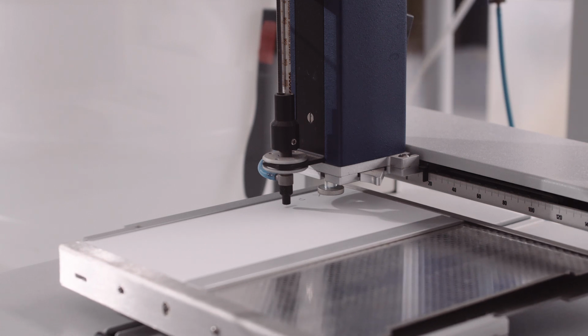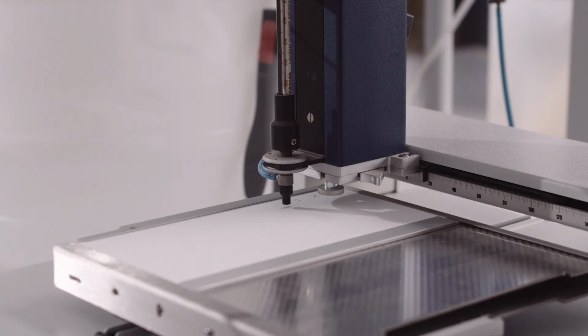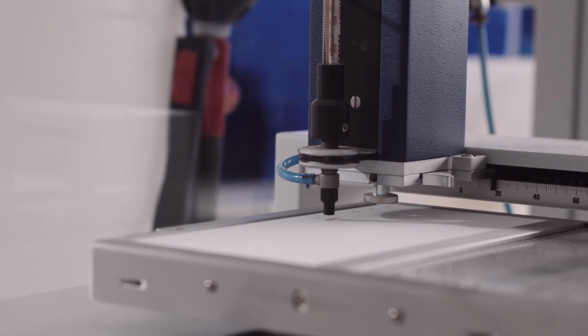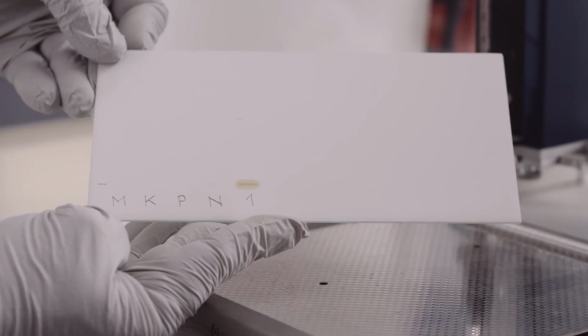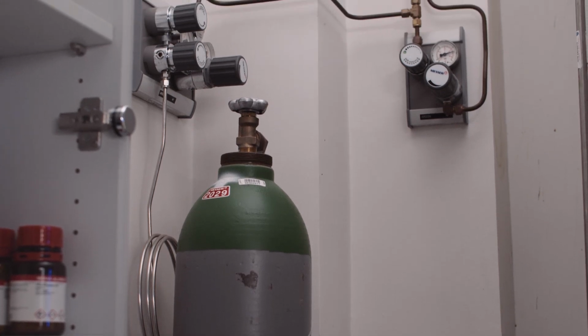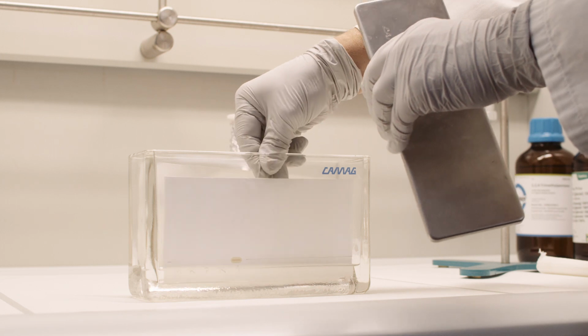First, apply the alkaloid standards of morphine, codeine, papaverine and narcotine to the chromatographic plate, and then apply concentrated extracts of poppy heads. The automatic applicator sprays the samples onto the plate while at the same time drying them with the help of propellant gas in the cylinder. The plate is then inserted into the chromatographic tank and developed.